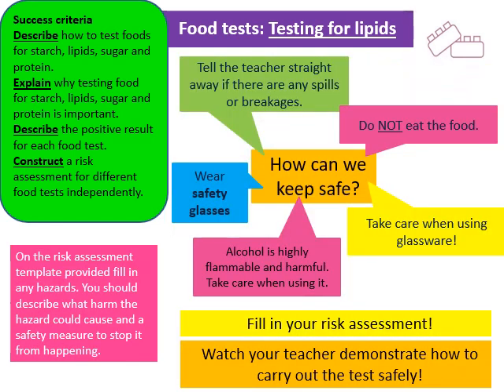As I said on the previous slide, we are going to do a risk assessment for the lipids practical as well. So I've given you a couple of ideas, again, of things we might need to be mindful of. So I mentioned ethanol in the previous slide. I've got on the slide here that alcohol is highly flammable and harmful, so we must be really careful when we're using it. You don't want to get it near a flame.